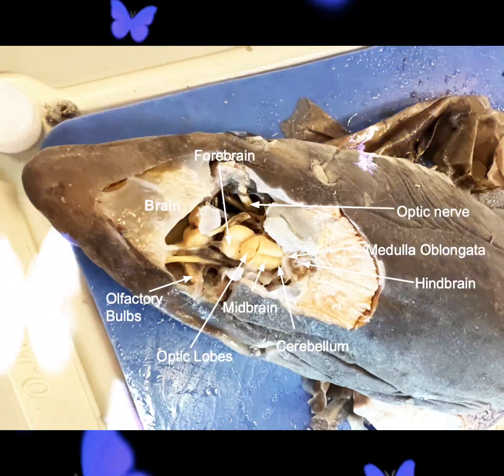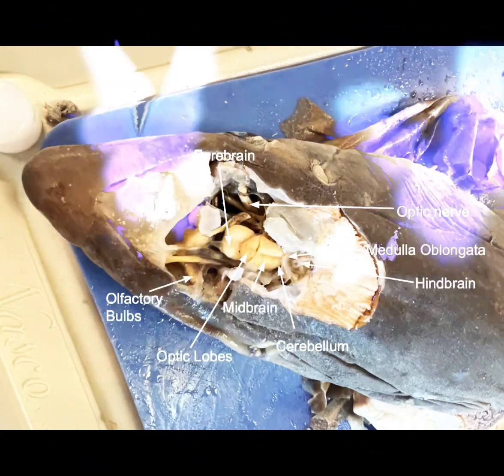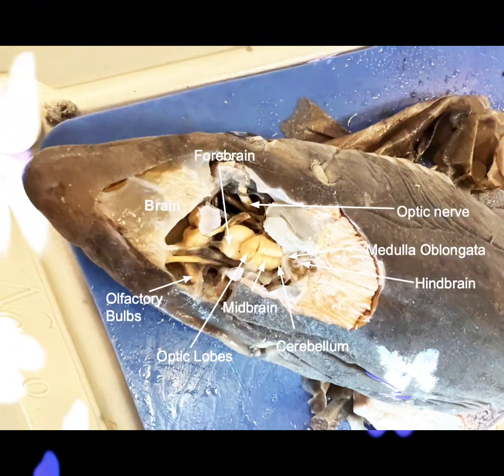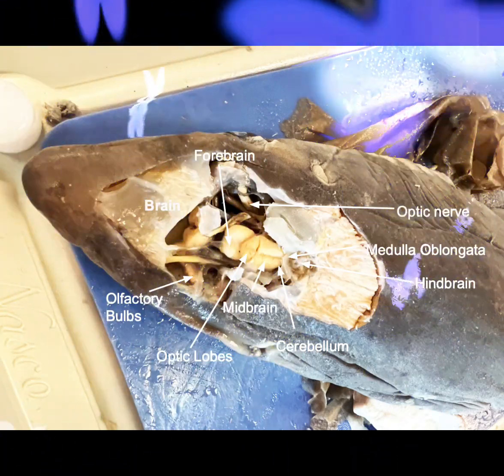Sharks' brains have 3 sections, the first being the forebrain. This section of the brain contains olfactory bulbs, which can detect smells from the nose and send it to the brain, as well as the thalamus, which is the section of the brain that detects sensory input through touch, taste, and hearing. Lastly, it holds the hypothalamus and pituitary gland, which helps keep the body stable.